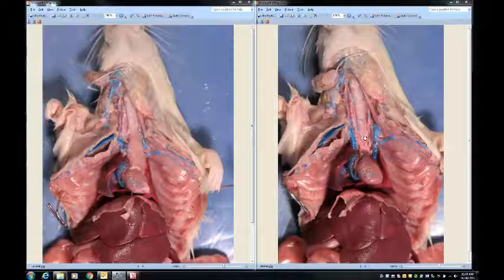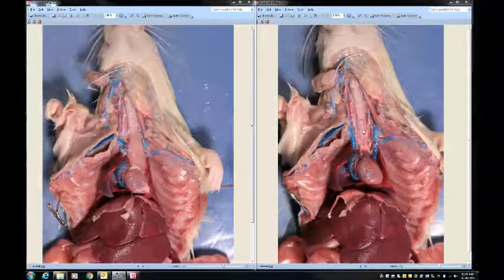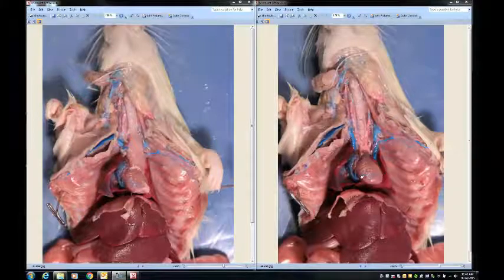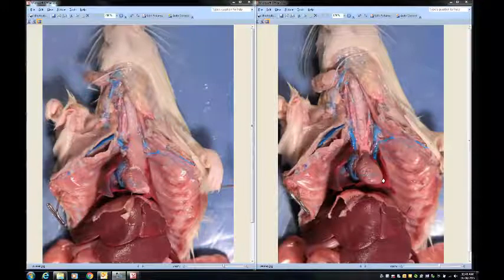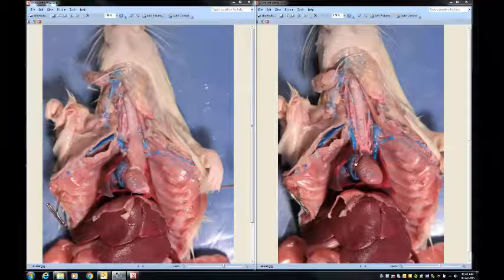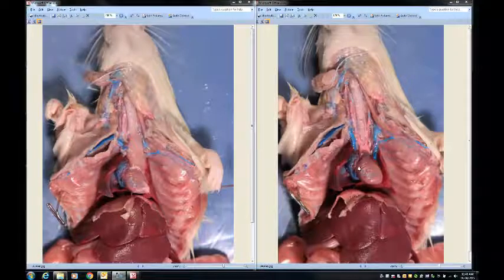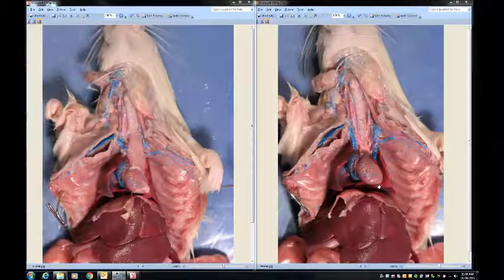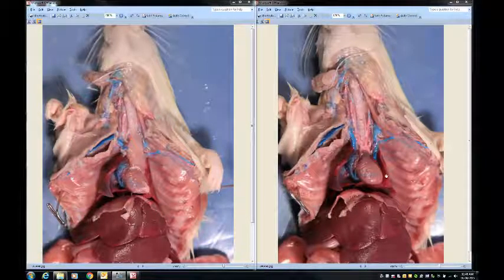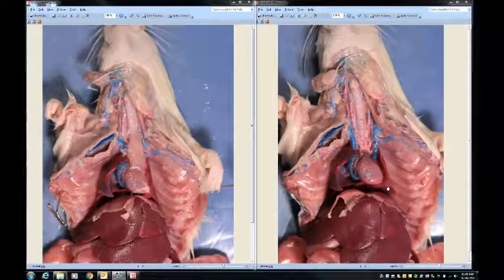Looking closely at the heart: the bottom portion contains the ventricles, and the top portion — that red part — contains the atria. Remember that when we're talking about the sides of the heart and body on the rat, we're talking from the perspective of the rat. So even though it looks like the left side to us, this would be considered the right side of the heart and the right lung, and this would be considered the left side of the heart and the left lung.